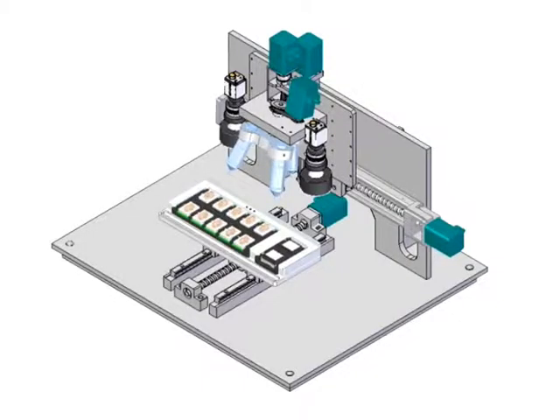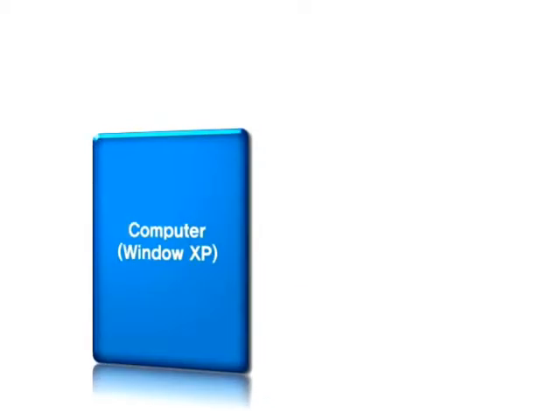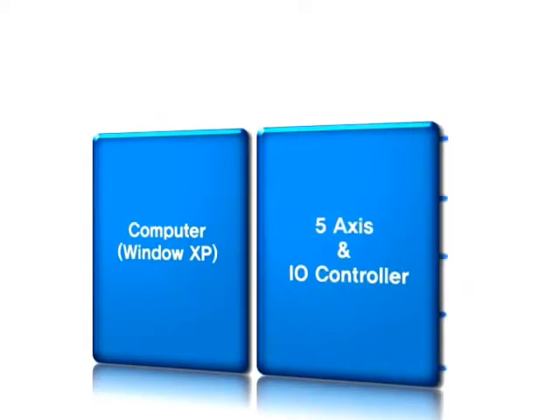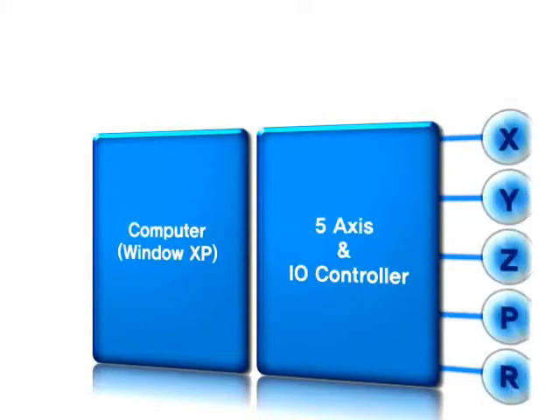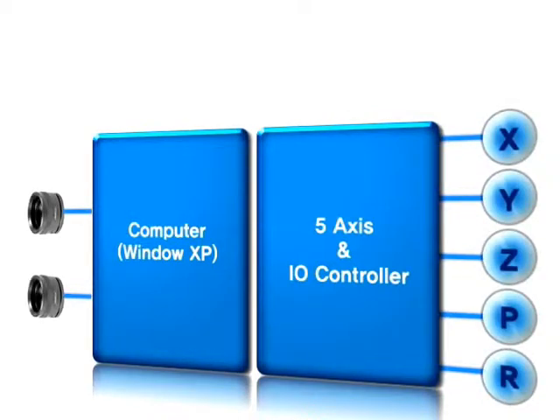In other words, in the instrument part are five step motors, three linear motion guides, the main plate, and two cameras. The control part is based on a commercial computer. It has a five-axis motion controller, a stepping motor, an I/O module, and two cameras. The cameras and the touchscreen are connected via USB.